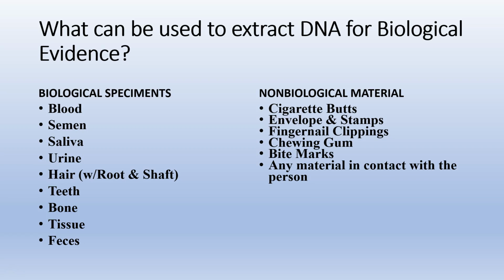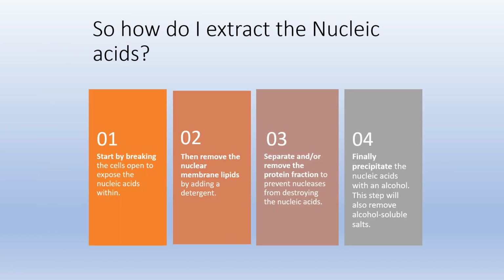This is why it is used as biological evidence for cases as well, right? In forensics, there's a huge need for forensic biology and people who can do exactly that: extract DNA and make fingerprints of individuals for forensics needs.